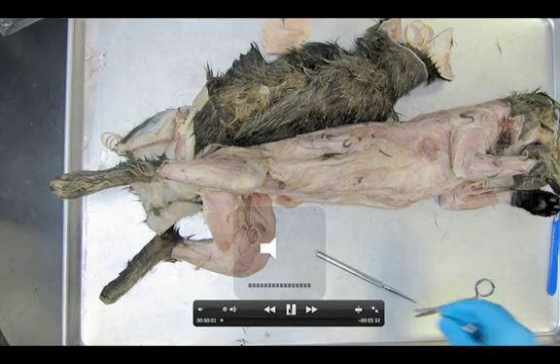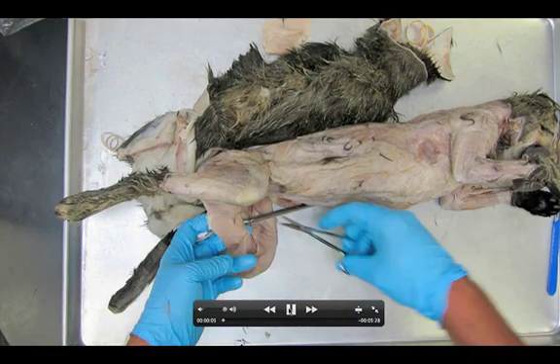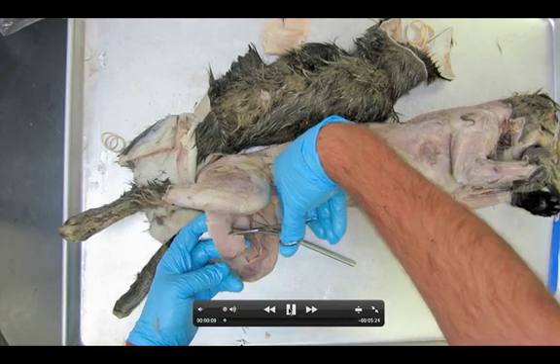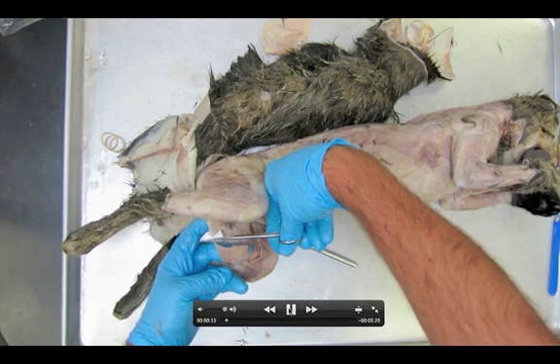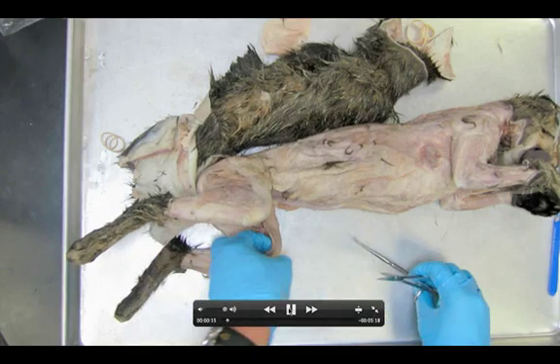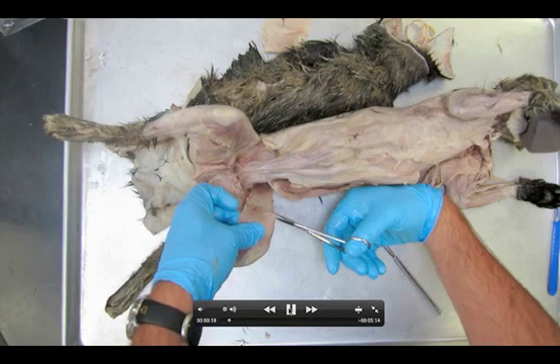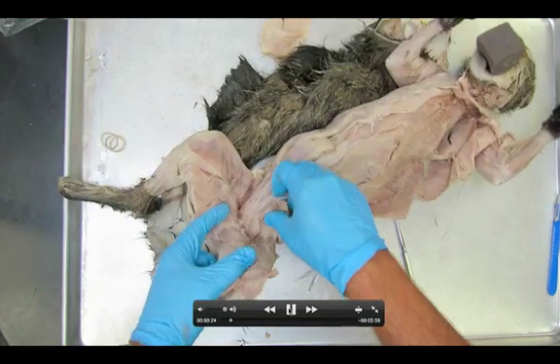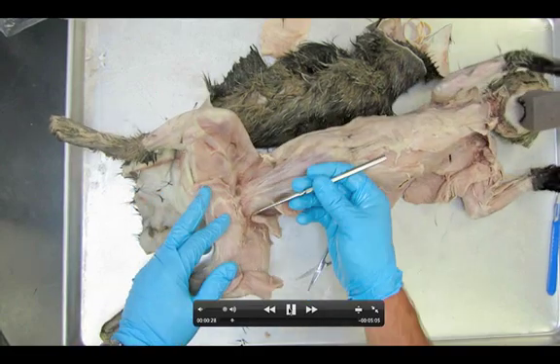Here we go — we're going to take a look at dissection number 11: the deep thigh muscles. To begin, we're going to quickly cut through the gracilis muscle, being careful not to probe or stab anything below. Then we'll cut through the sartorius muscle up above, using the same approach. We'll start with what we call the adductor muscles.